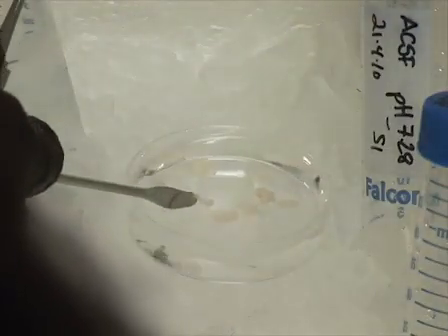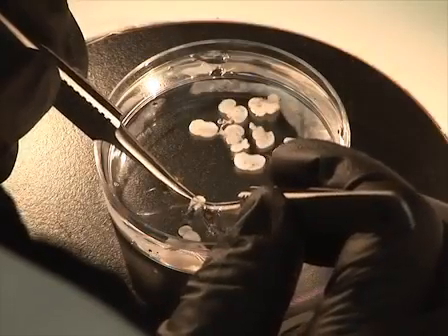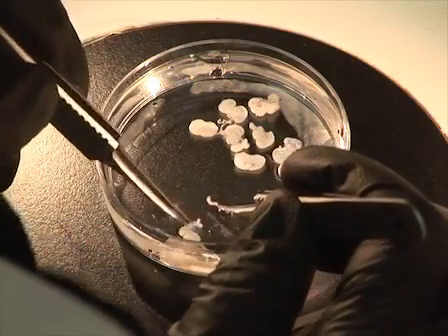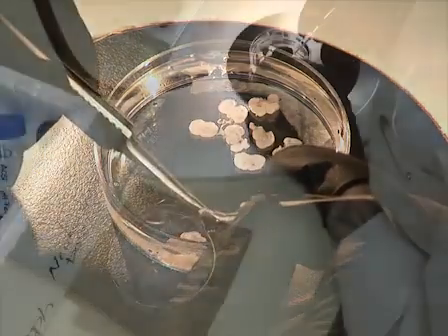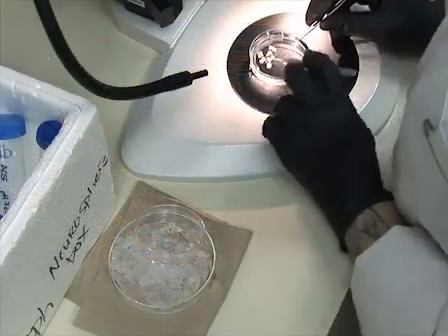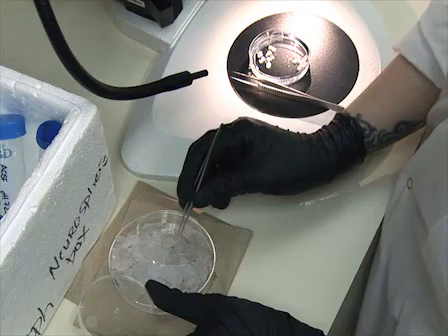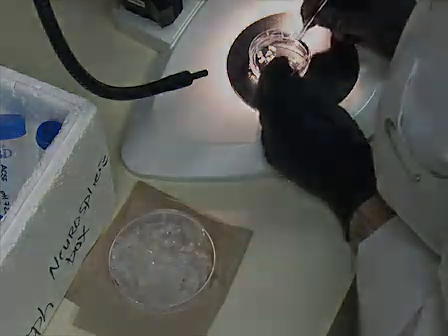Once all slices are collected, proceed to the hippocampal dissection using a stereo microscope. We only take the dorsal hippocampus approximately between bregma minus 1.65 millimeters and minus 2.10 millimeters. Place the hippocampi in an empty ice-cold dish. When all the hippocampi have been collected from the slices, it's time to bring them into the flow hood for mechanical dissociation using a scalpel.